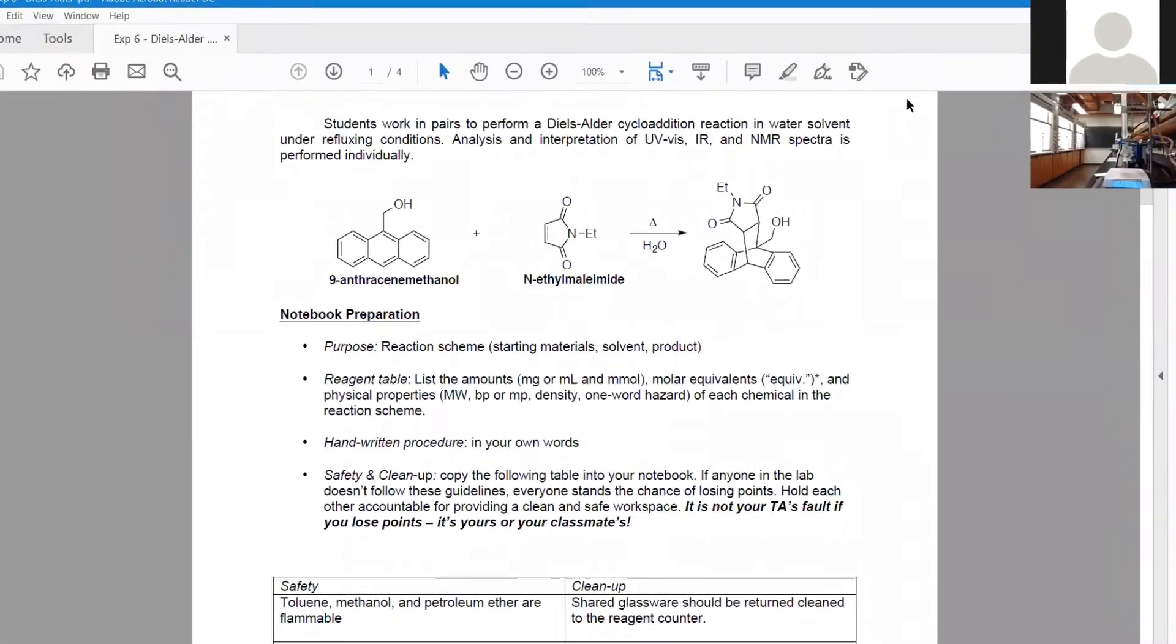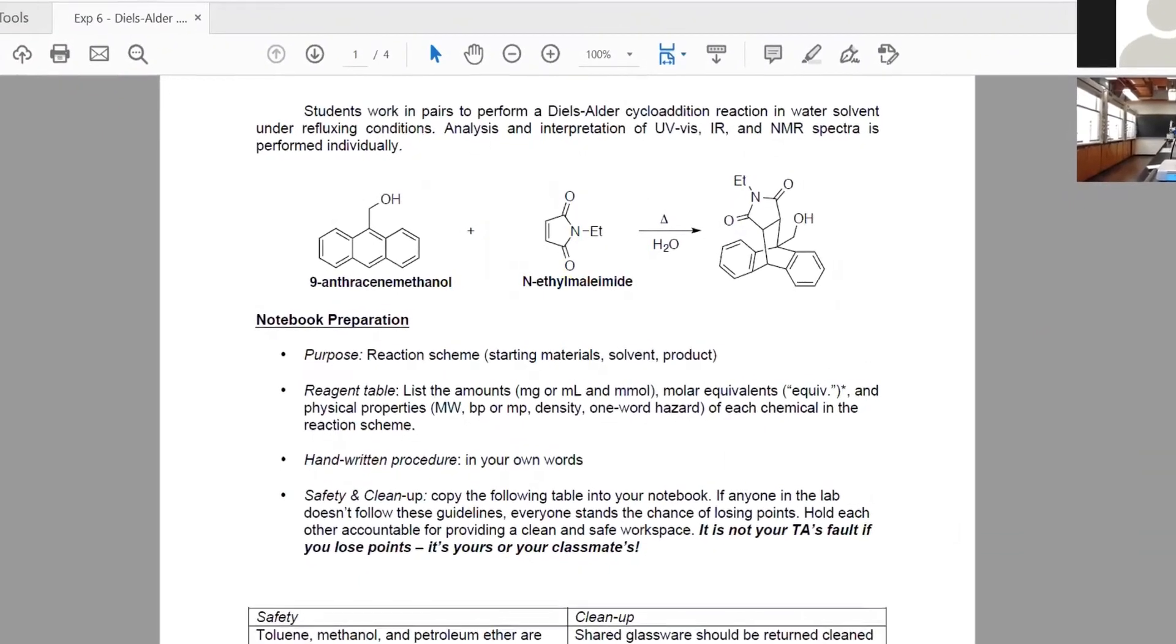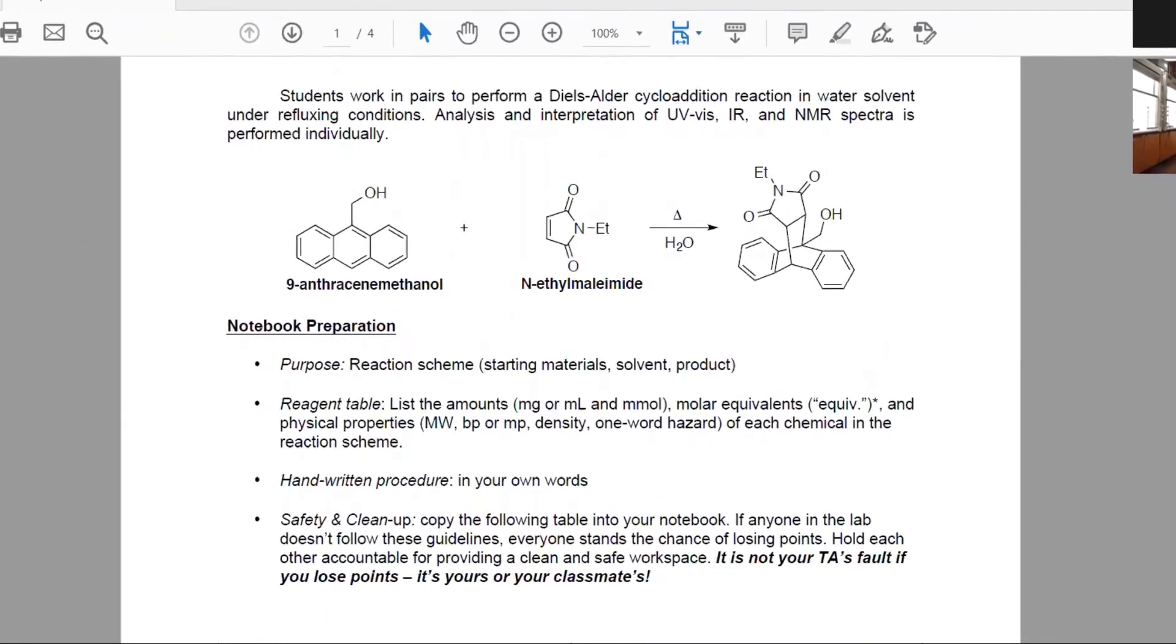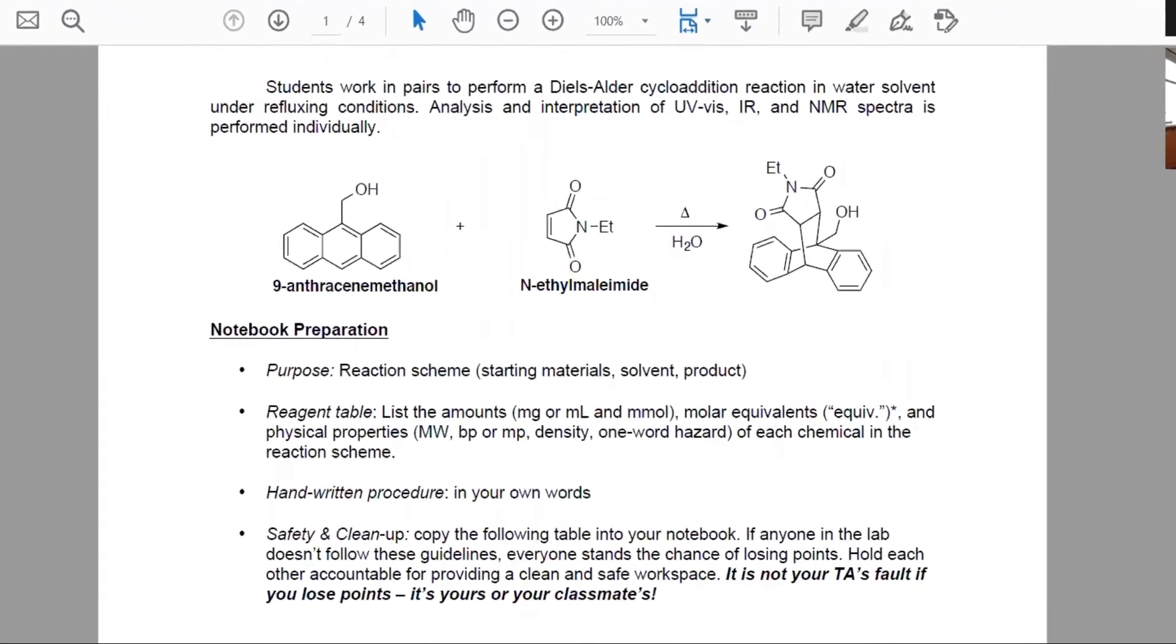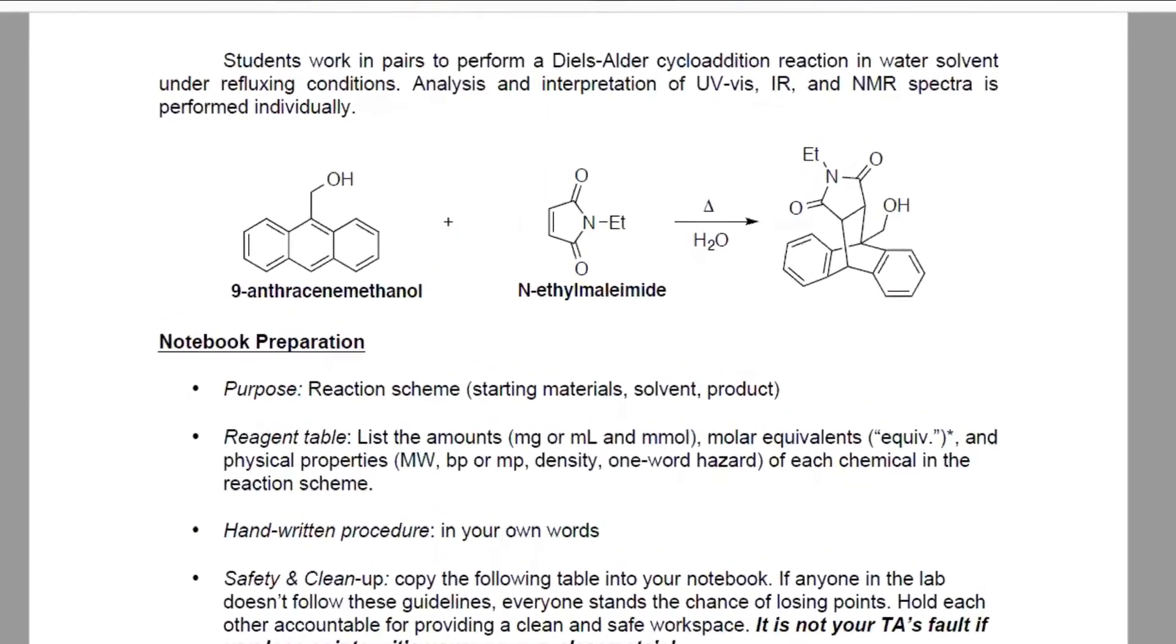Okay, so this is experiment six, the Diels-Alder reaction, and right here we're just looking at Daniel's setup of 9-anthracene methanol with NEM in water. And we're going to go ahead and start this reflux.